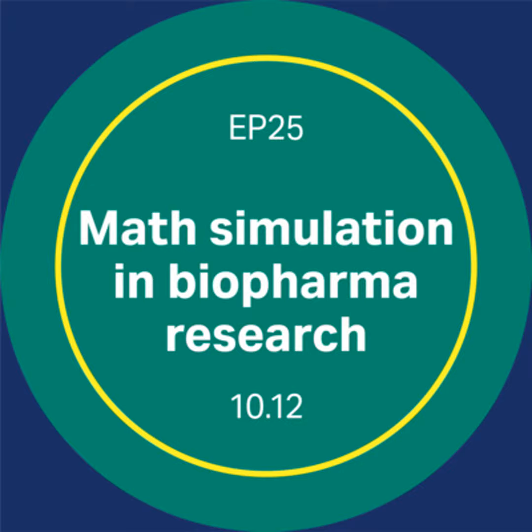Hubbuch. Got it. And he worked on simulating chromatography at his previous research group. And because of licensing issues, he could not bring the code with him. So he asked in the math department, is there somebody that could help out, write a small simulator for chromatography? And that ended up on my desk because I had free resources and wanted to work on something else for a change.